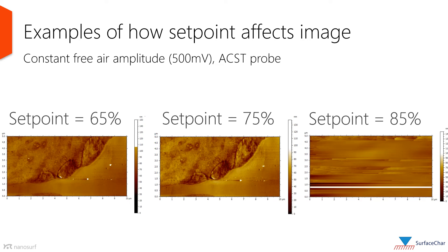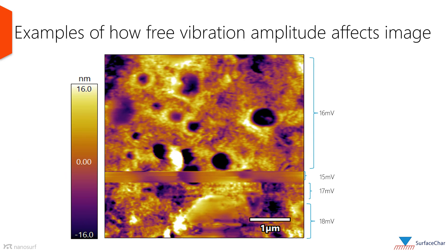Shown here are examples of how the setpoint affects image quality. The higher the percentage, the lower the setpoint. The setpoint on the right is clearly too low — the entire image is smeared due to insufficient interaction of the tip with the surface. Setpoints on the left and the middle are both acceptable. Too high a setpoint can cause the cantilever to rebound off the surface and cause ringing noise in the image. Insufficient free amplitude, less than 16 mV in this case, also causes smearing due to lack of sufficient interaction between the surface and the tip.